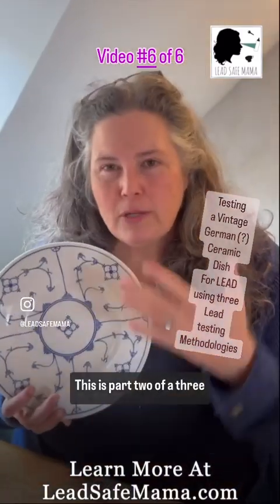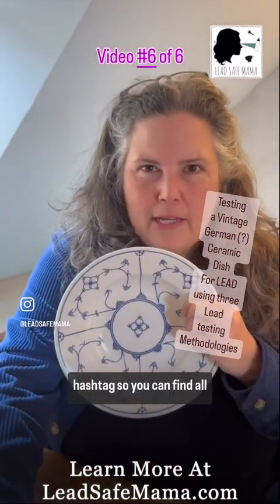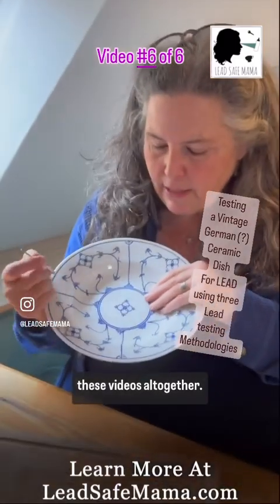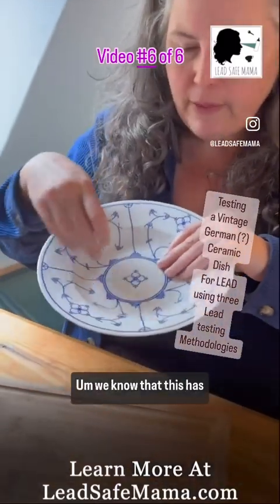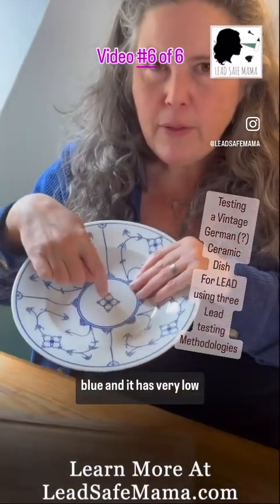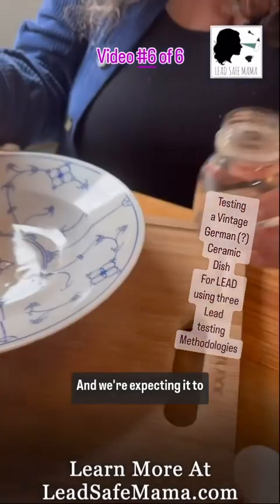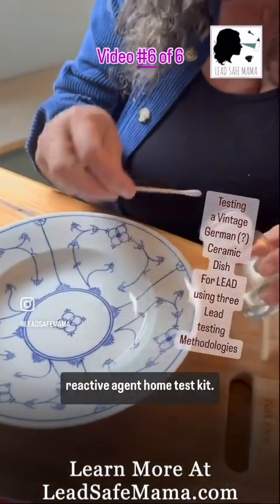This is part two of a three-part Lead Safe Mama Scotland video. I'm just using that as a hashtag so you can find all these videos together. We know that this has cobalt, which is a poison — the blue — and it has very little lead, around 40 parts per million. We're expecting it to test negative using the reactive agent home test kit.